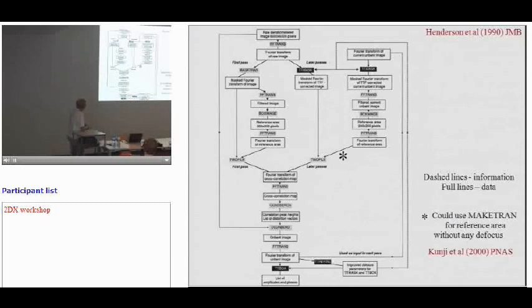Then, of course, you've used an area from the middle of this micrograph, and it was also a noisy part of the original image. So you've done your best in a single pass through the image. But if you then take this unbent image and take it right back round to the beginning again, and then filter that with a smaller diameter hole, a smaller mask, so that you're getting greater averaging, that reference image that you started with, which was only maybe less than 1% of the area of your complete image, after being unbent and refiltered is then the average of the entire image. It's an almost noise-free reference image.